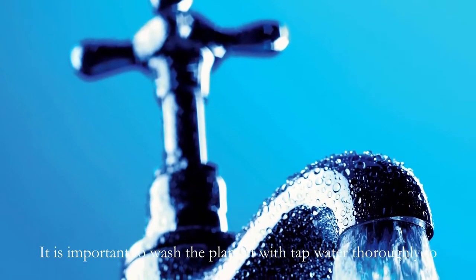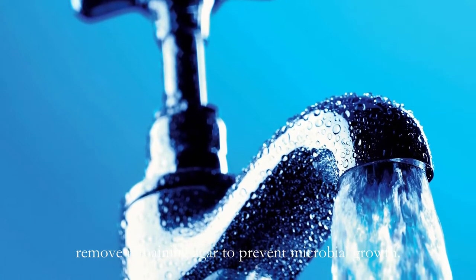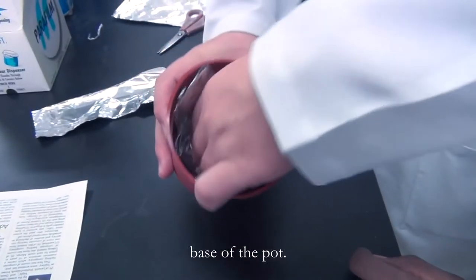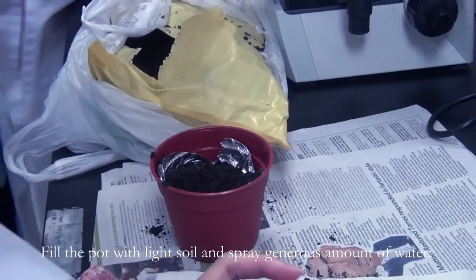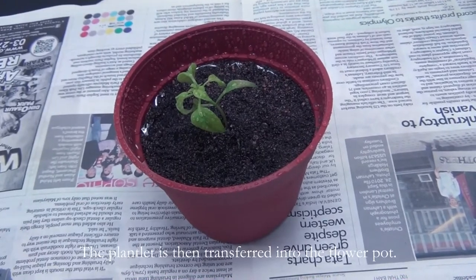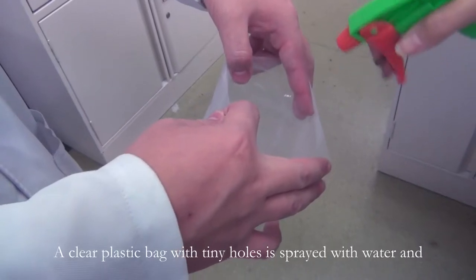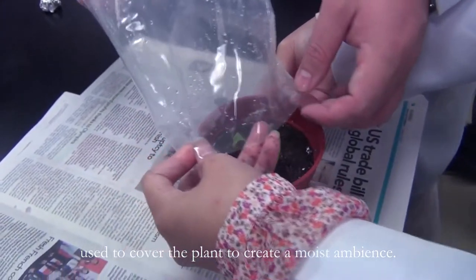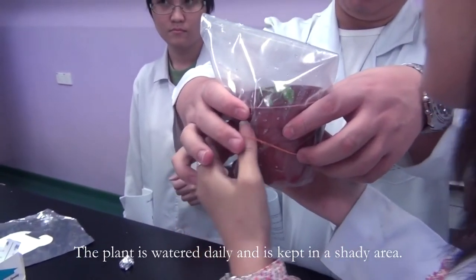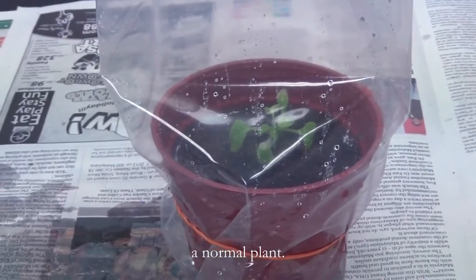It is important to wash the plantlet with tap water thoroughly to remove remaining agar to prevent microbial growth. To prepare the flower pot, place an aluminum foil into the base of the pot. Fill the pot with light soil and spray a generous amount of water. The plantlet is then transferred into the flower pot. A clear plastic bag with tiny holes is sprayed with water and used to cover the plant to create a moist ambience. The plant is watered daily and is kept in a shady area. When the plant has adapted to the new environment, it can grow as a normal plant.